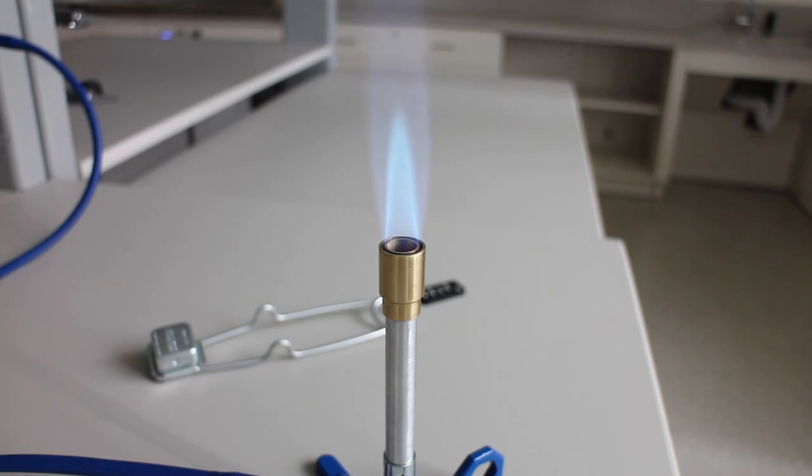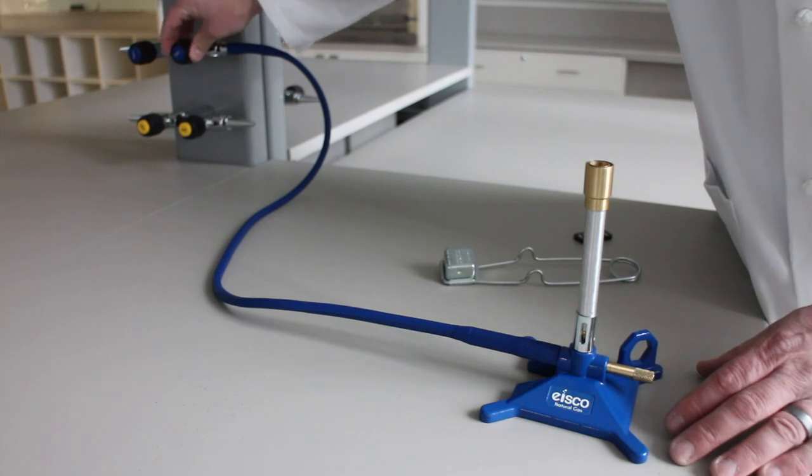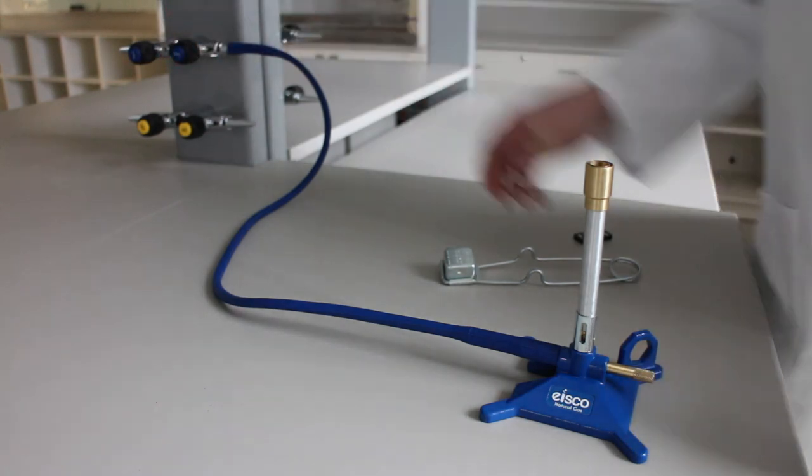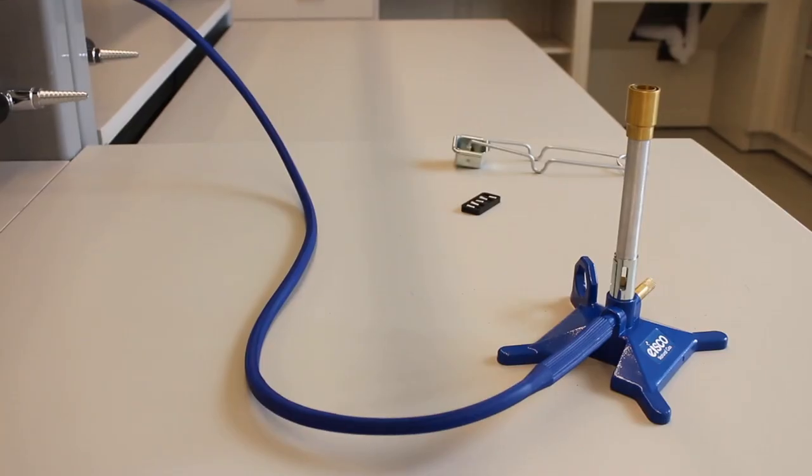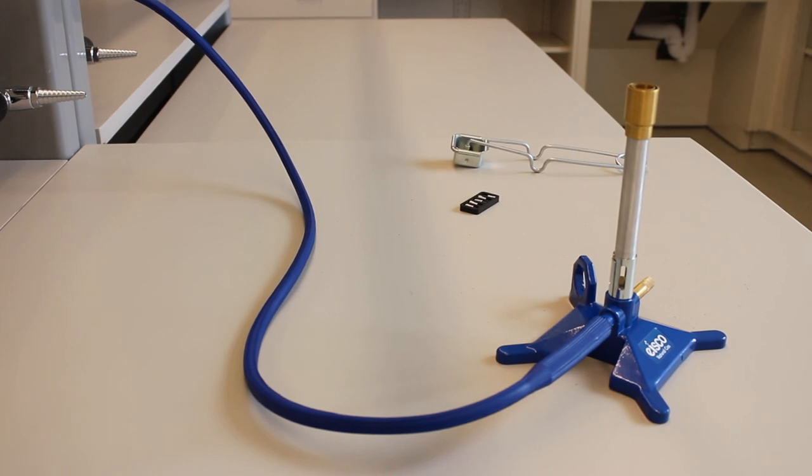Never leave a Bunsen burner running when you are not actively using it. When you're done with the Bunsen burner, simply turn off the main gas control on your lab bench. Keep in mind that the burner will remain very hot for a while after it is turned off.